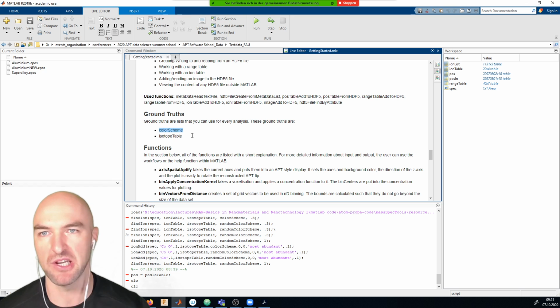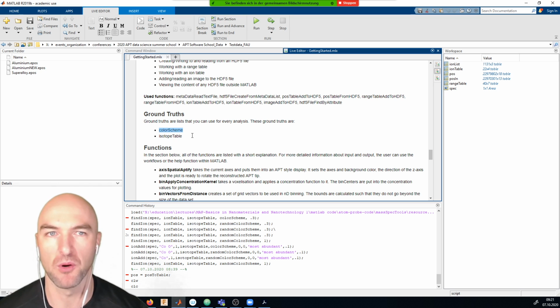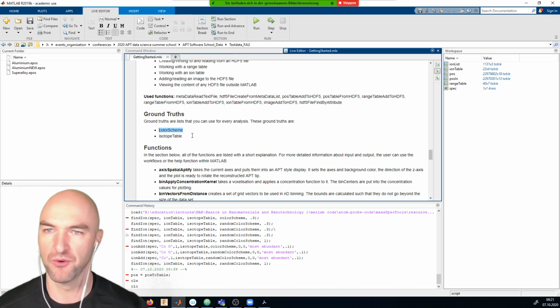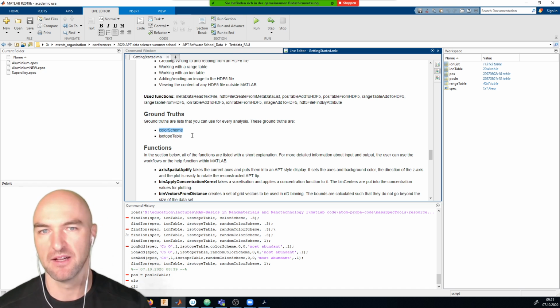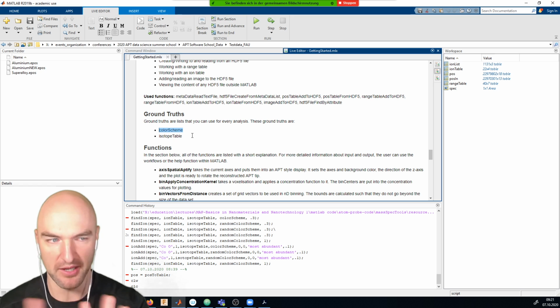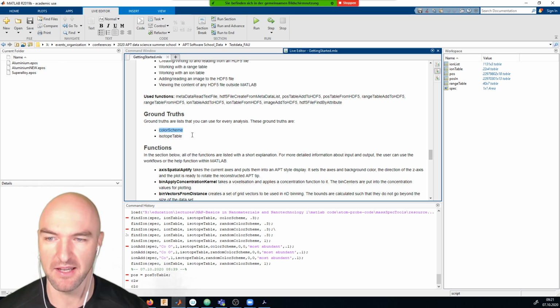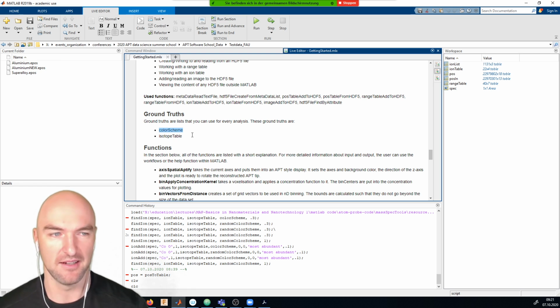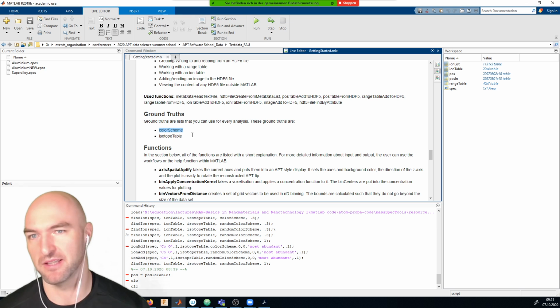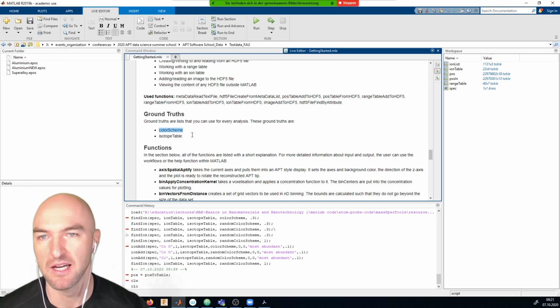Especially if you work with certain material systems, which is the case for most of us, then you will probably come up with a nice color scheme for your material system, hopefully such that different elements are not too similarly colored, and ideally that it caters to the colorblind, so that colorblind people can see things properly, and so on and so forth.